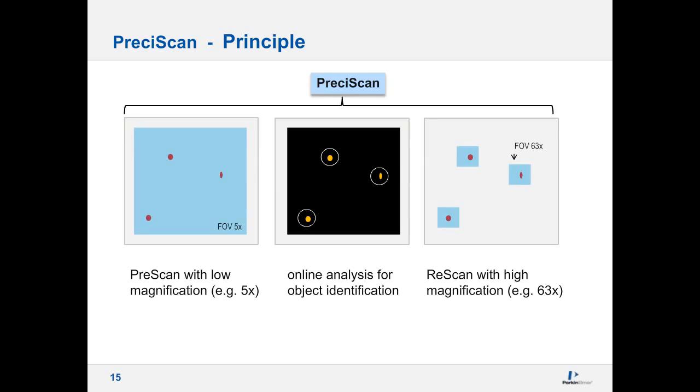Imaging the whole well at high resolution becomes impractical because it would create a huge amount of data in the search of very few cells that are really of interest. The same holds true, for example, for microtissues, which may be located anywhere in the well and where you want to acquire a high-resolution stack.